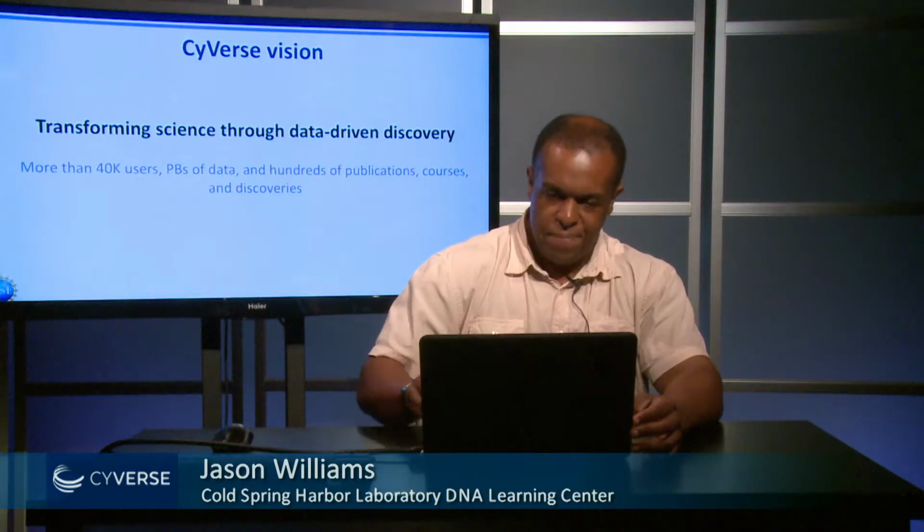Okay, so what I intend to do is just give you a very high-level overview, briefly, of CyVerse as a project. Then we're going to cover 3 demos on data upload, analysis in the CyVerse Discovery Environment, as well as using the Atmosphere Cloud. So let's get started.